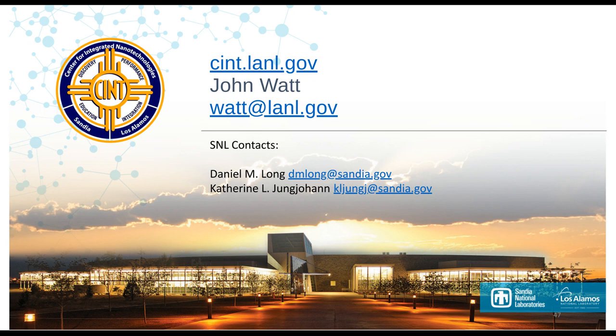Thank you, Daniel. Let's see, the next question is for John. What are some of the biggest challenges for lift out of polymers and soft matter?